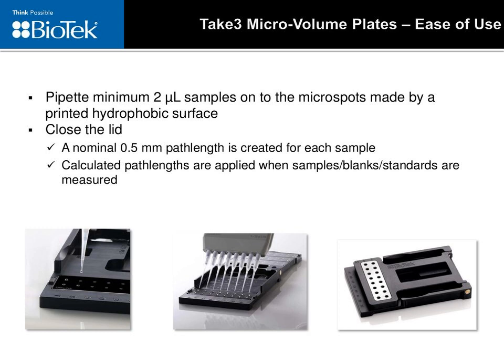Given the minimal volume being used, a multi-channel pipetter is preferred to prevent long exposure times to ambient air, which may result in evaporation and thus concentration of the sample, which can result in increased error between individual samples.